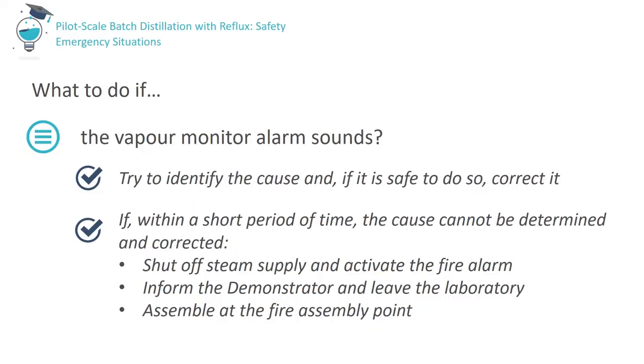If the vapour monitor alarm sounds, try to identify the cause — for example, has there been a liquid spill onto the vapour sensor, has the cooling water failed (in which case the cooling water alarm should also be sounding), or has a tray sample valve been left open? If it is safe to do so, correct the cause. If you are unable to quickly determine and correct the cause of the alarm, shut off the steam supply to the column and leave the room. Activate the fire alarm, inform the demonstrator or another member of staff, leave the engineering building, and assemble at the local fire assembly point. For the UCD pilot plant, the closest assembly point is at the foot of the stairs leading into the engineering building.